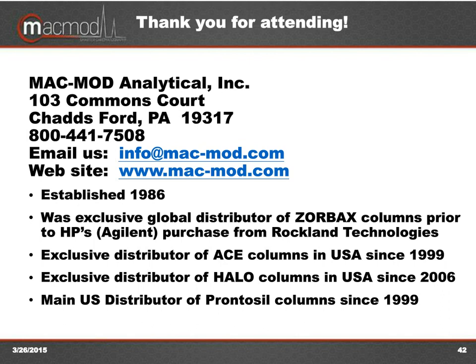Now that work is being carried on after John Dolan passed the torch to Dwight Stoll at the University of Minnesota, and he is the one continuing with characterization of columns, and then puts the data up on the web and on the USP site so that people can make scientifically based empirical decisions about which columns are closest and which columns are most dissimilar in selectivity.